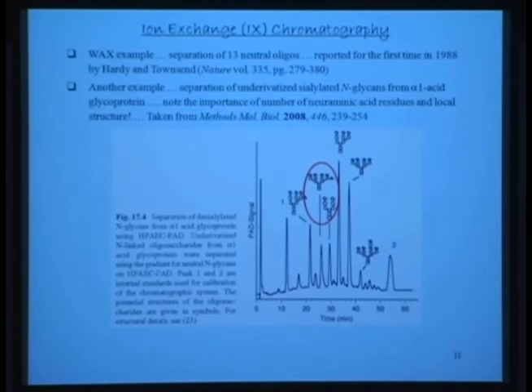they isolated, what is it? N-linked oligosaccharides from alpha-1 acid glycoprotein were separated on gradient neutral oligosaccharides. And by using mass spectrometry, you can actually directly identify that this corresponds to that particular structure. That is the power of the technique. Okay.